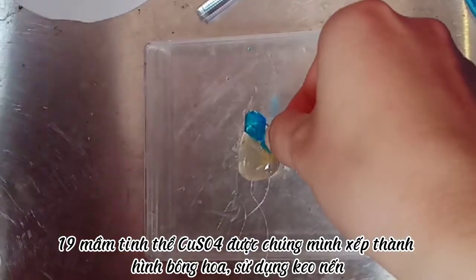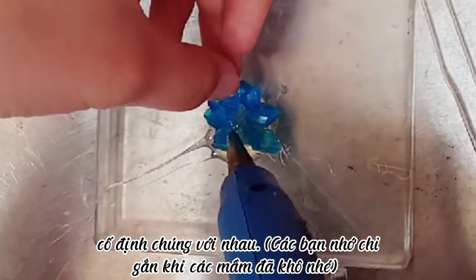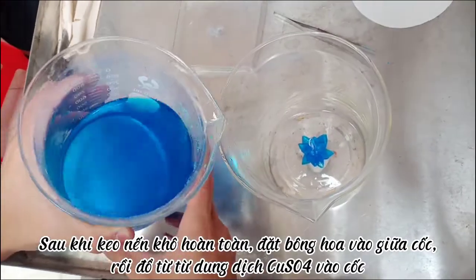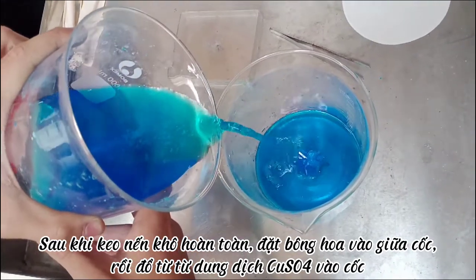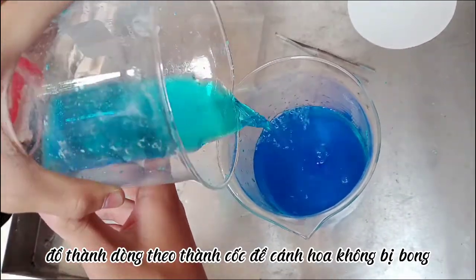19 copper-2 sulfate crystal sprouts are arranged in a flower shape using hot stick glue to stick them together. Remember to only attach when the sprouts are dry. After the hot stick glue is completely dry, place the flower in the center of the cup and then slowly pour the copper-2 sulfate solution into the cup. Pour along the side of the cup to prevent the petal from falling off.